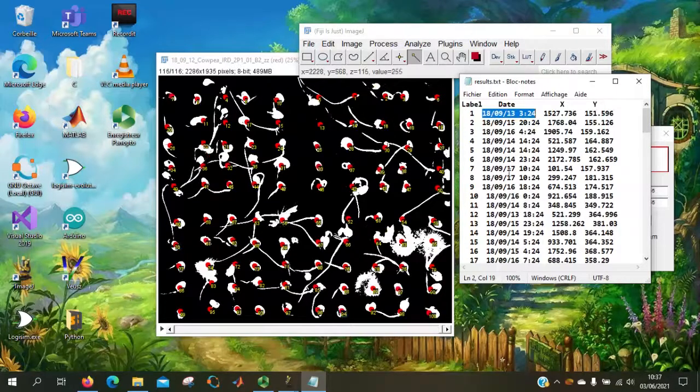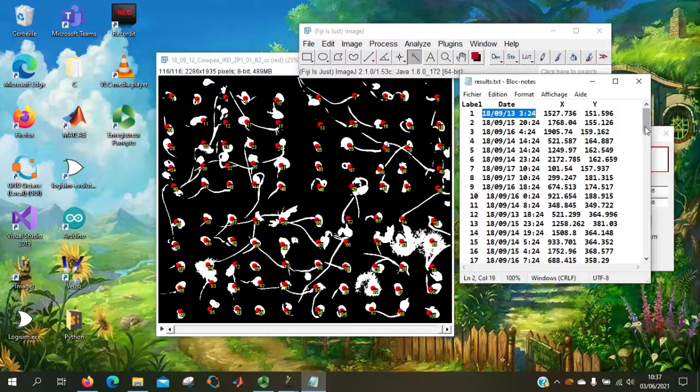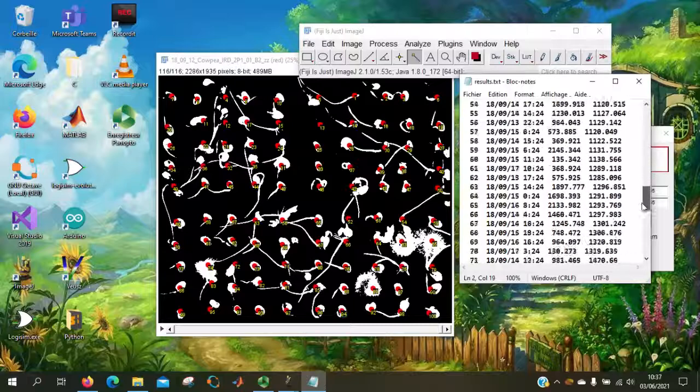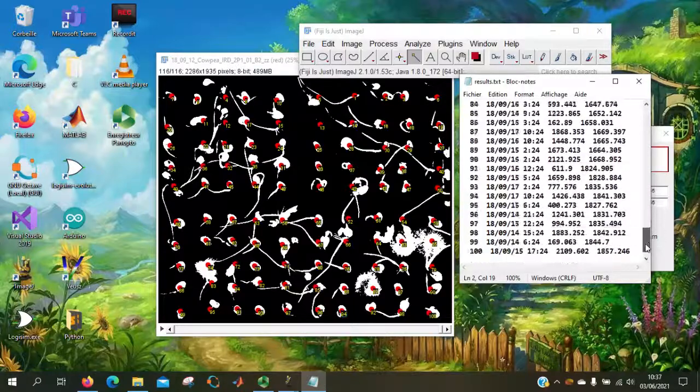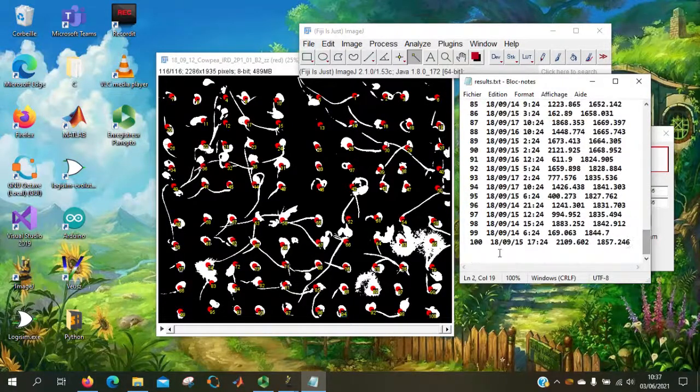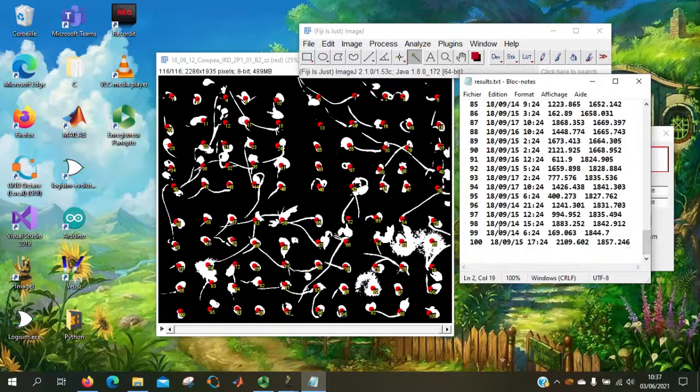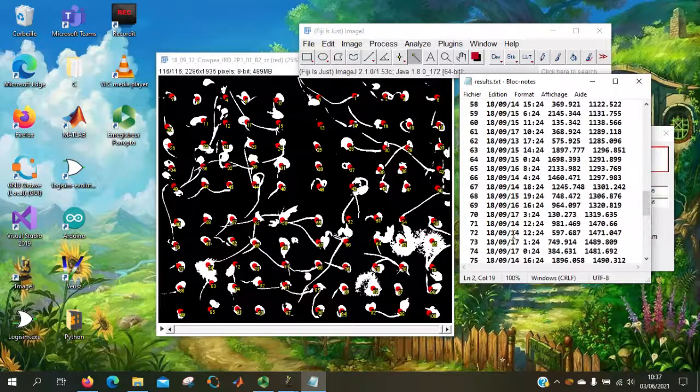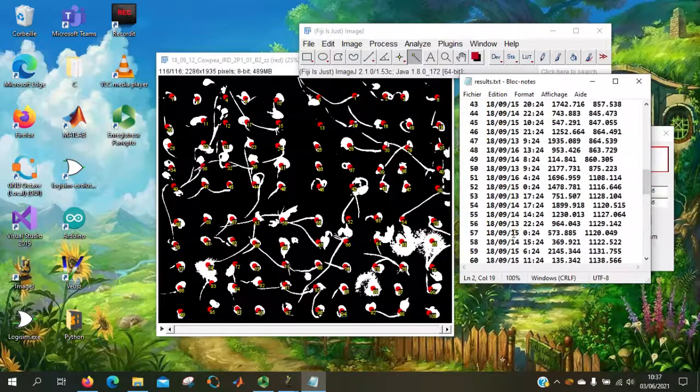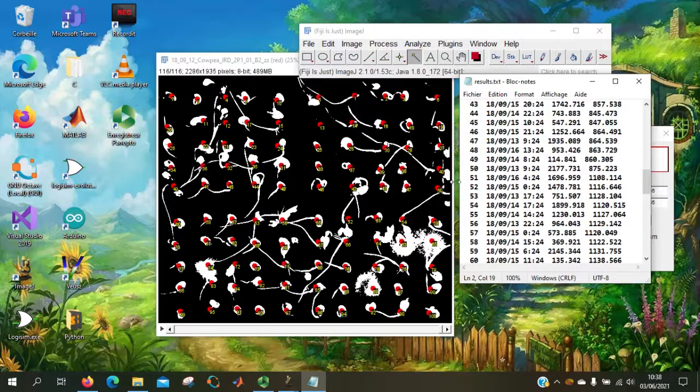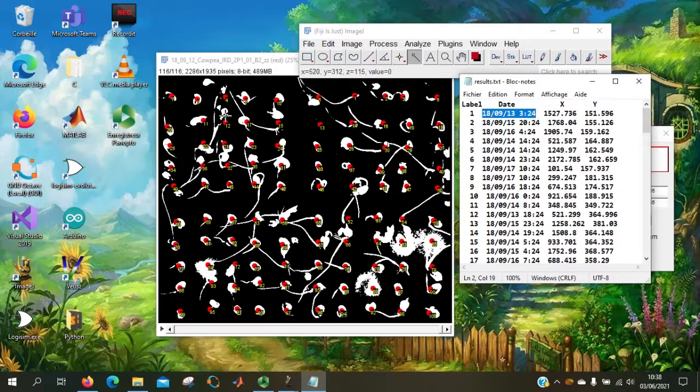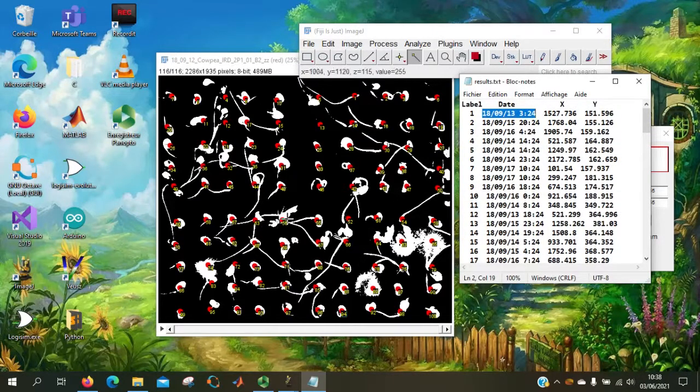So here we have 100 results. All those seeds, position, date, and the label to refer directly to the image.